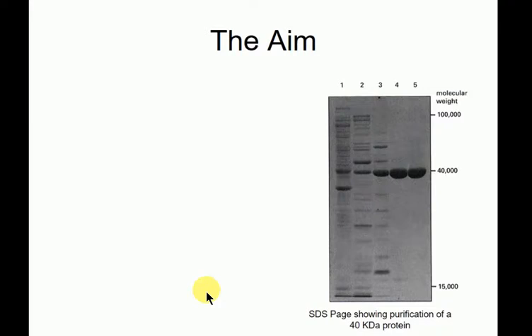Over time, we've got these different stages of purification. In stage 2, you get rid of this major contaminant, which was present in equal amounts with the protein of choice. In 3, you enrich again. Step 4 is probably your most successful step here. And in 5, you end up with a pure protein. So the aim is always to enrich and to minimize loss. Loss is the big one.